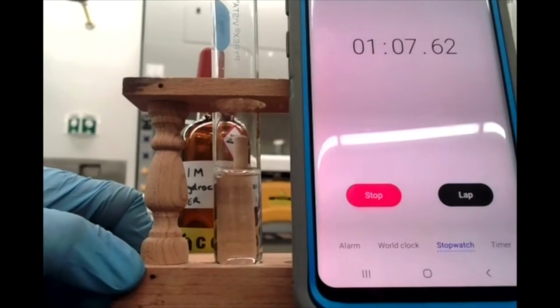So it's still bubbling, so make a note that you're waiting for it to stop bubbling completely.